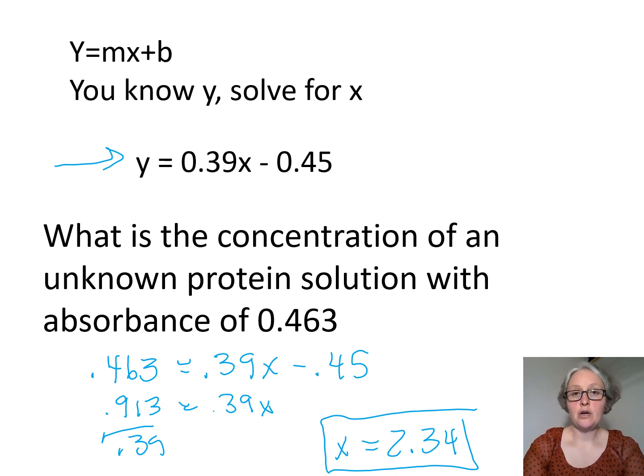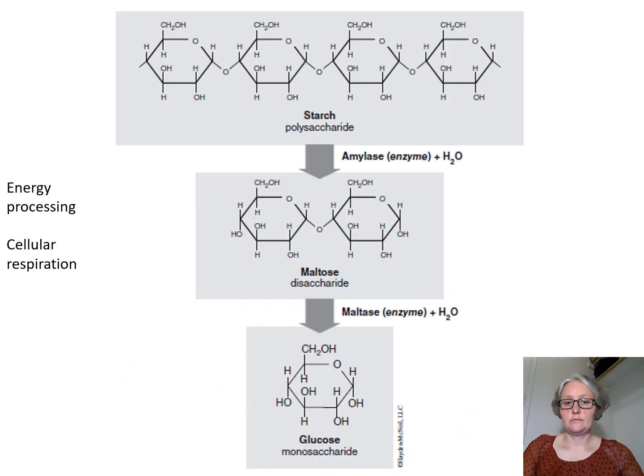You should definitely know and be comfortable with how to figure out the protein concentration of an unknown solution using both the hand-drawn or the box method and the equation of a line.